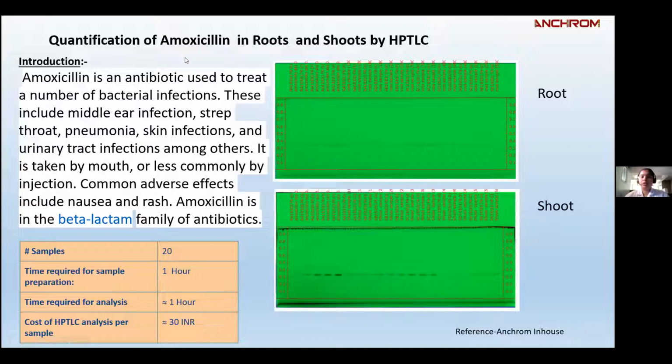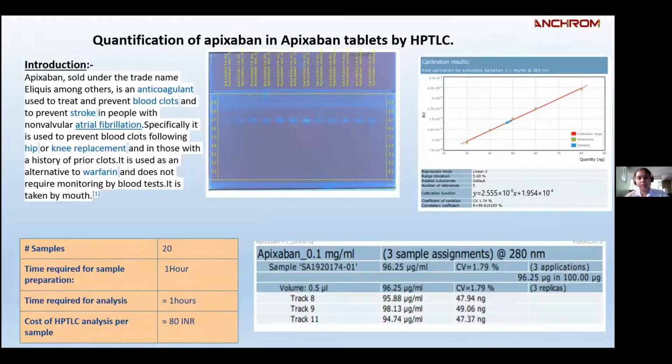Then not only that, another example is of amoxicillin. The same thing she has done: she has injected it in the plant, and she has found out, she has quantified how many nanograms the plant has absorbed from the soil. So this is an example of that.